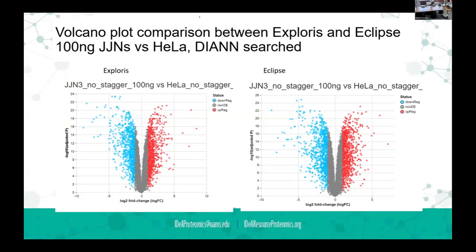Yeah, that's a great idea. The others are probably teetering on being detected or not detected. I think the differences are either great or they're near the line. I agree. And you can see how populated the data is at the small fold change, just kind of meeting significance there. So yeah, that's a good point.